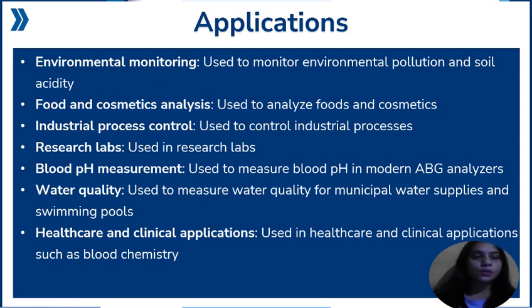Research labs, used for research purposes. Blood pH measurement, used for blood pH and modern blood gas analysis. Water quality, used for measuring water quality for municipal water supplies and swimming pools. Healthcare and clinical applications, such as blood chemistry.